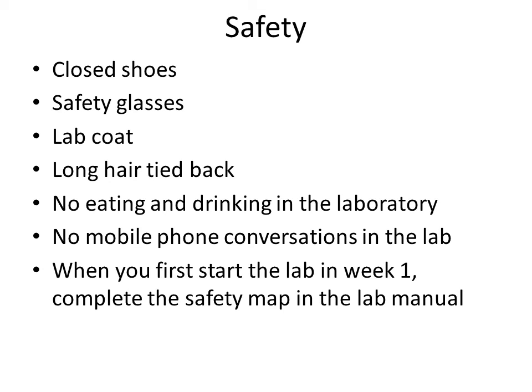There is a safety map in the lab manual which will help you identify all important safety features of the labs. You must complete this map and have it signed by a demonstrator when you first come to the lab.